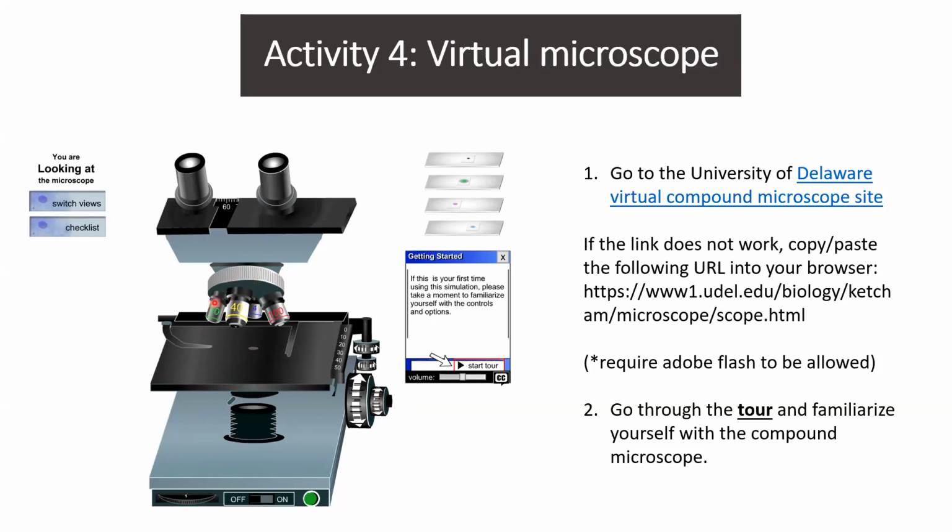So then once you feel like your image is focused at 10x, you're going to move up to 40x. Here, once again, you're only going to use your fine adjustment knob and focus your image. If you use a microscope this way, you will always be able to find your image. You should have no problems.